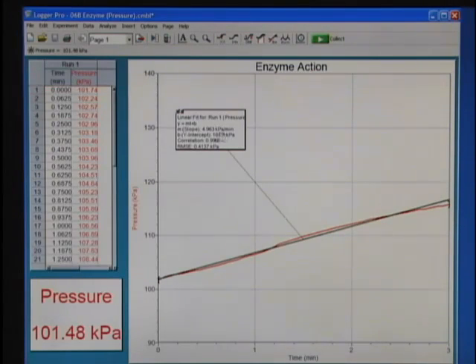We will repeat this experiment with test tubes two, three, and four, adding two drops of enzyme to test tube two, three drops to test tube three, and four drops to test tube four.